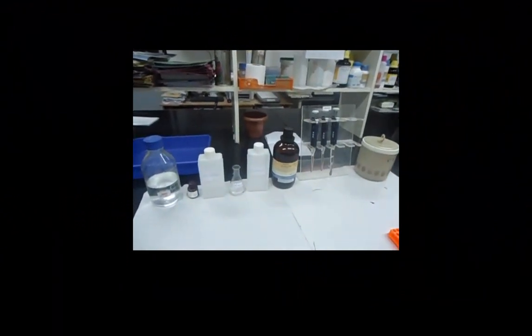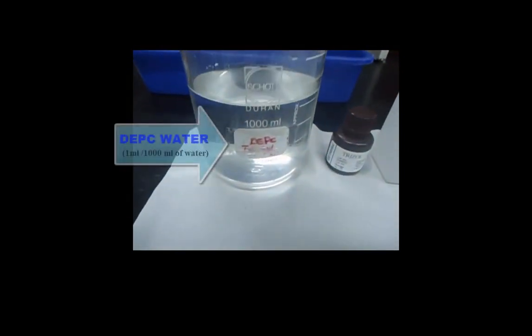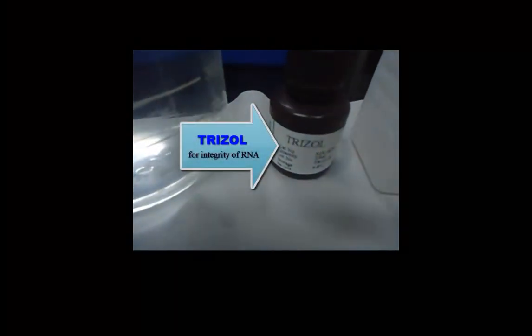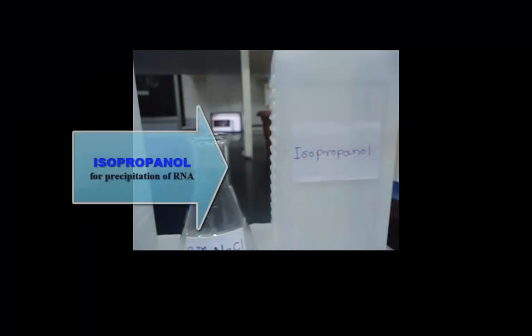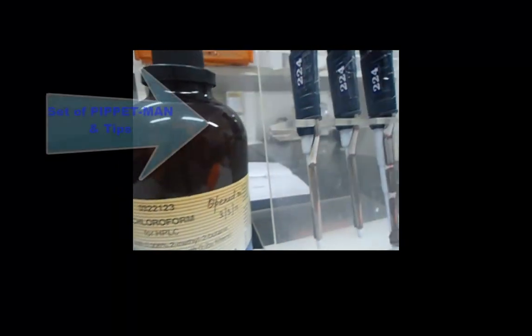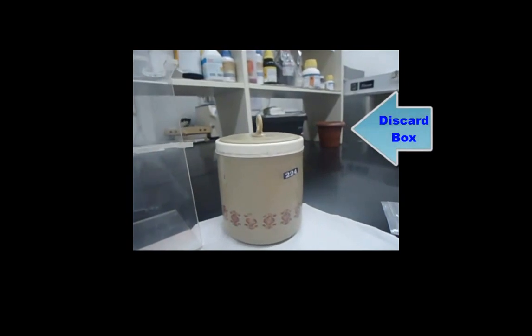RNA isolation by the trizol method is a simple and efficient method. Here, the trizol kit consists of DEPC water 1 ppm, trizol for integrity of RNA, 75% ethanol acting as a salt remover, 2 molar NaCl and isopropanol for RNA precipitation, chloroform for forming an organic phase, a set of pipettes and tips, ice box, and lastly a discard box.